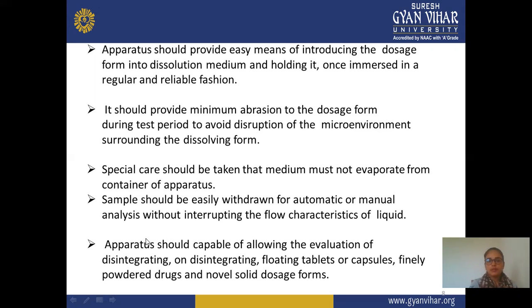Next, the apparatus should be capable of allowing the evaluation of a disintegrating tablet or capsule, finely powdered drug, and novel solid dosage forms. Means the apparatus should allow your tablet or capsule to disintegrate, that is, break up, and after disintegration it can easily dissolve in the solution and float in that particular solution.